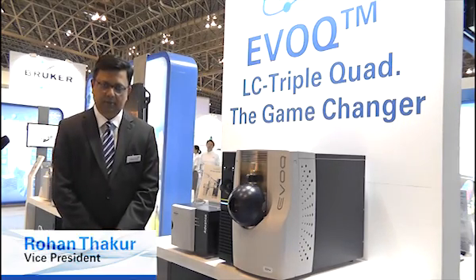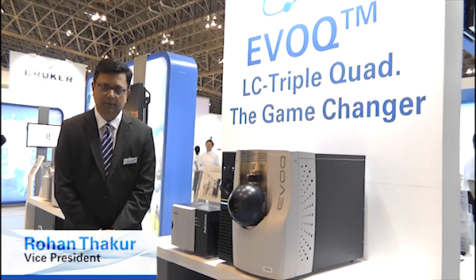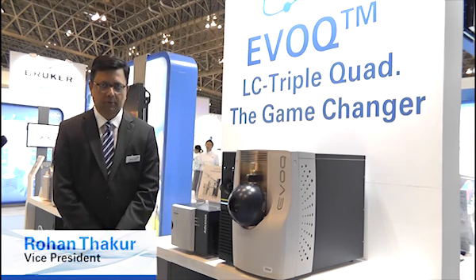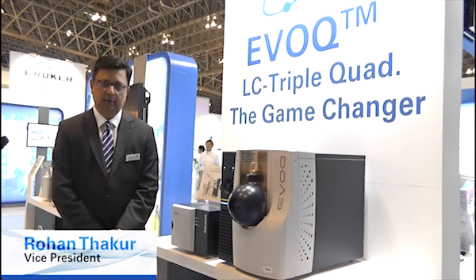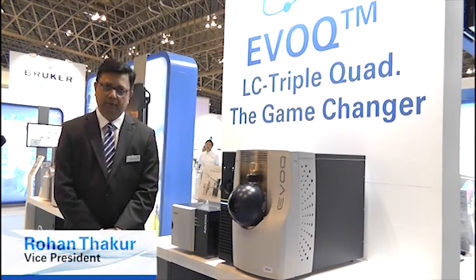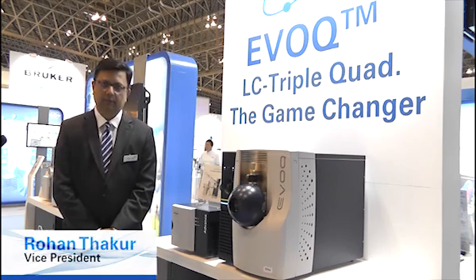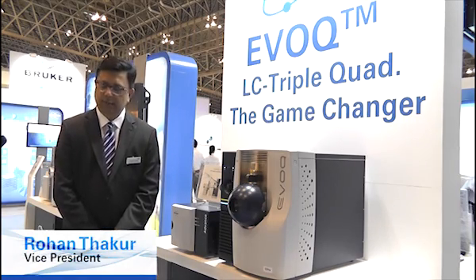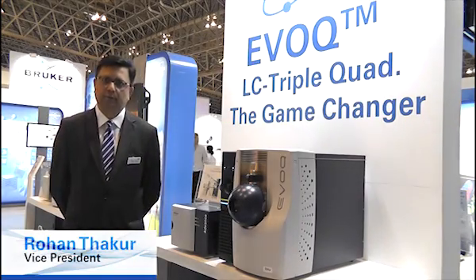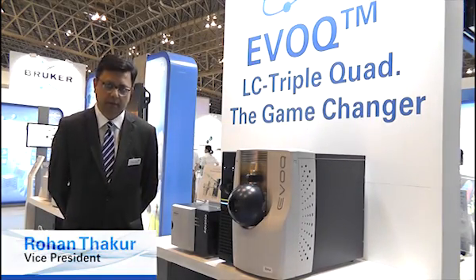Over the last two years, the CAM group has brought innovative products to the market, starting with the Scion GC triple quadrupole, the Scion GC single quadrupole, the Scion GCs earlier this year at Analytica — the 436 and the 456 — with the industry's fastest detectors running at 600 hertz, followed by an LC triple stage quadrupole that was purpose built for the applied market.